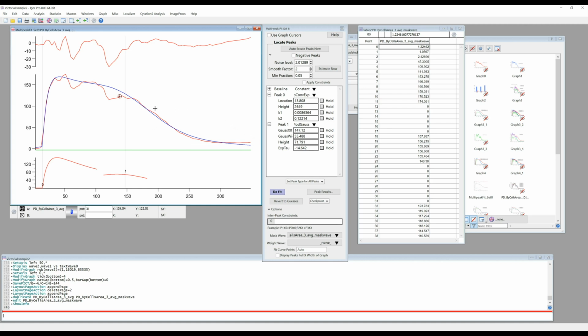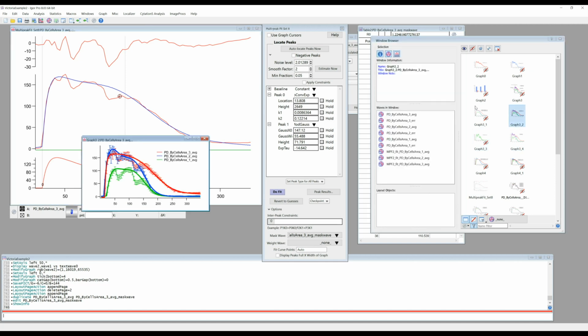As you can see in this portion of the graph, the fit curve does not quite closely follow the experimental curve. Despite being suboptimal, this fit result is good enough to serve as an aid for eyes to qualitatively relay information about the experiment.